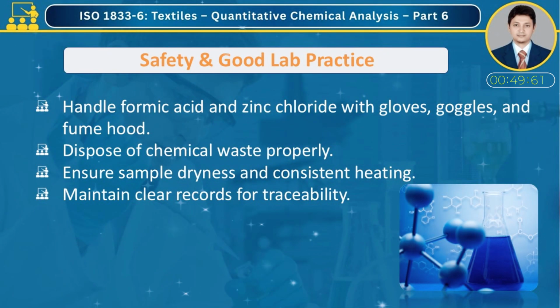Safety, good laboratory practice and summary. This method involves the handling of hazardous chemicals such as formic acid and zinc chloride. Always wear appropriate personal protective equipment including gloves, goggles, and a lab coat, and conduct all operations in a well-ventilated area or fume hood. Dispose of chemical waste according to environmental and institutional regulations. Maintain accurate records of reagent batches, test conditions, and calculation data.